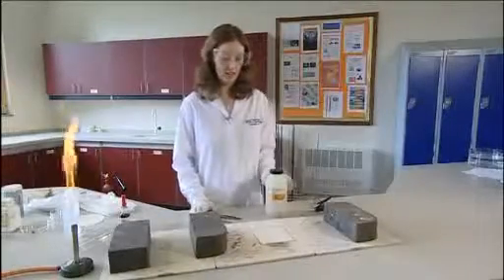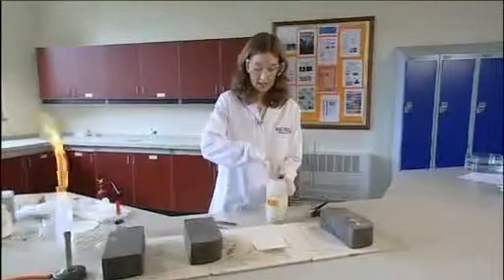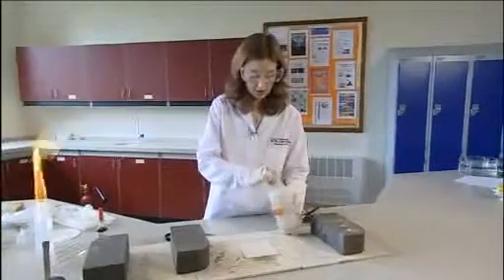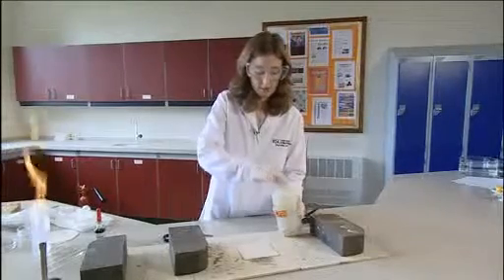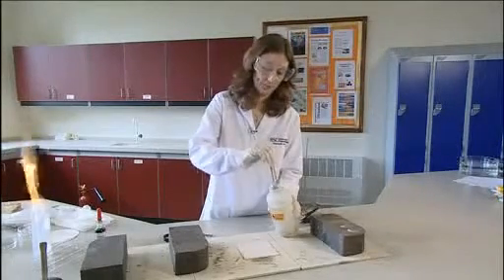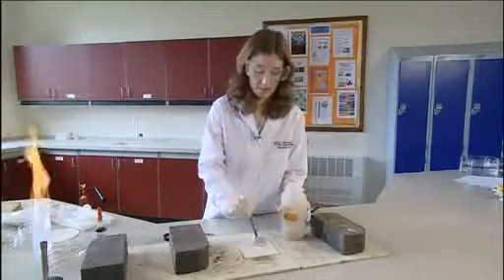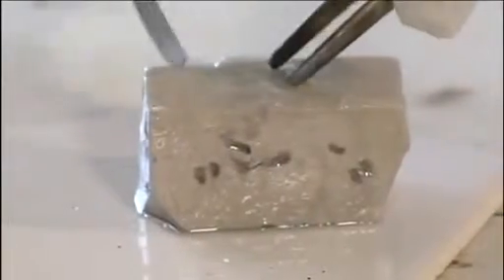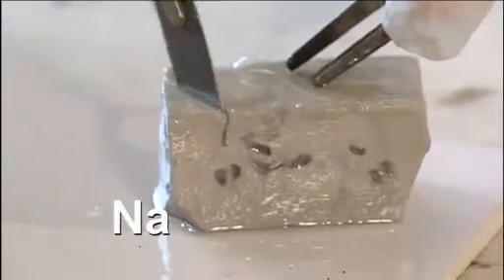Next, we're going to look at the reaction of sodium metal. Again, indicate to your class that sodium is stored in oil to protect it from reacting with the moist air. Okay, so we need to cut a piece of sodium off this large piece.